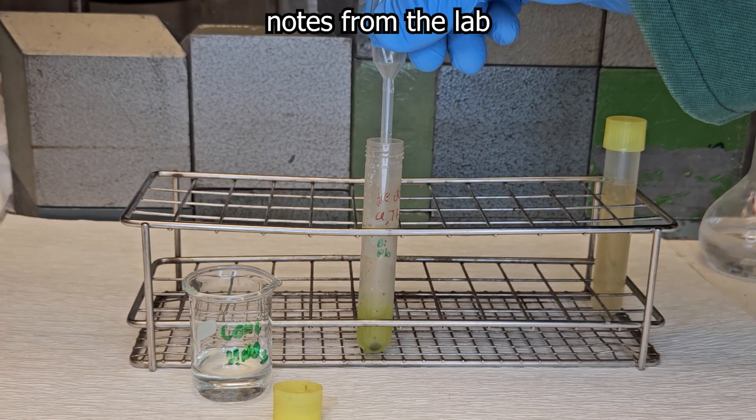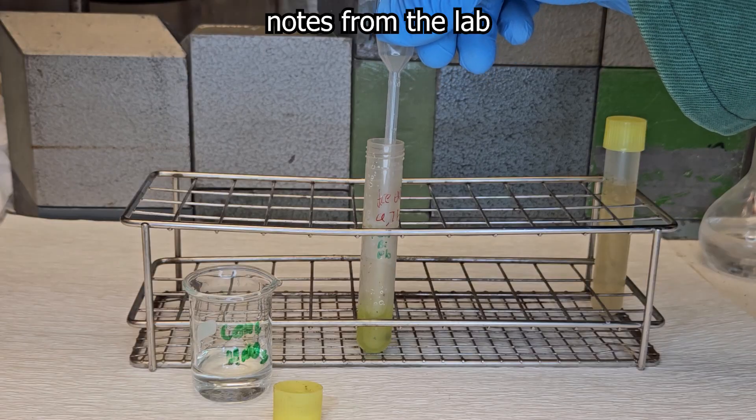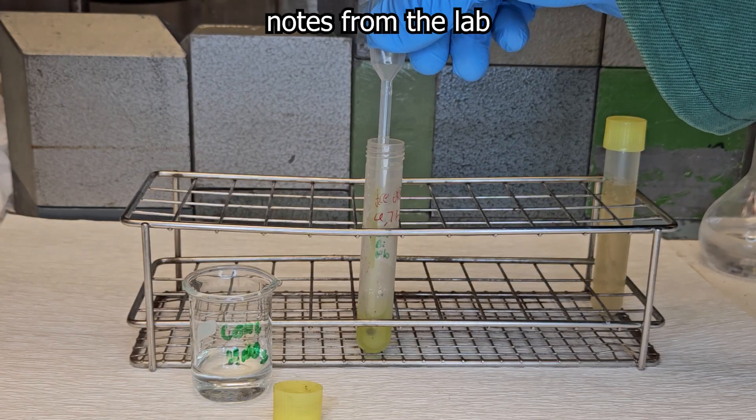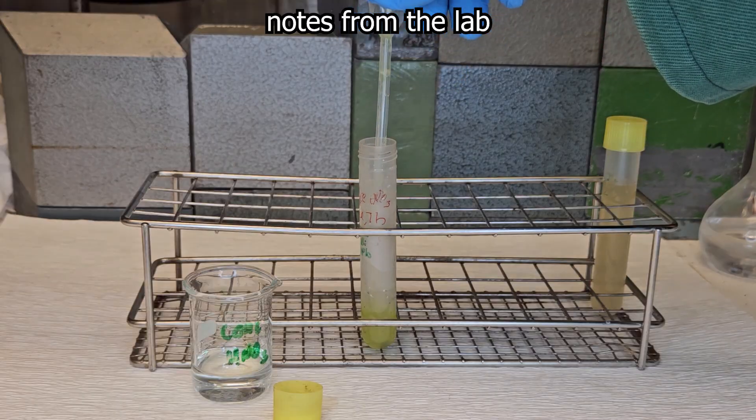It is quite possible that a residue remains after this sulfate precipitation step, which is not even soluble in concentrated nitric acid. This flake can be discarded. Any polonium present has already dissolved.